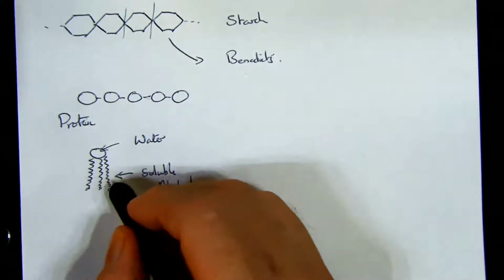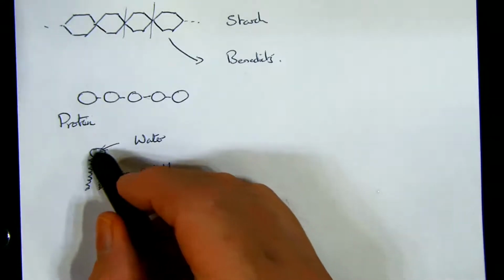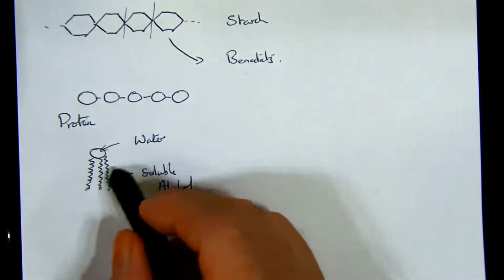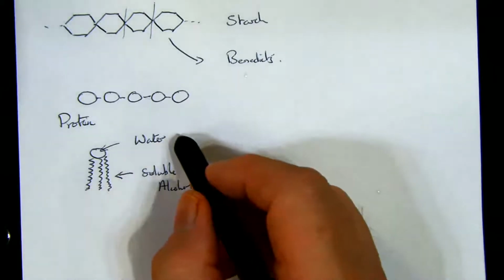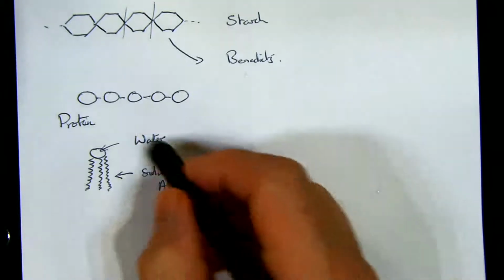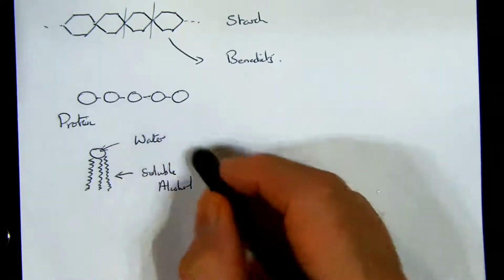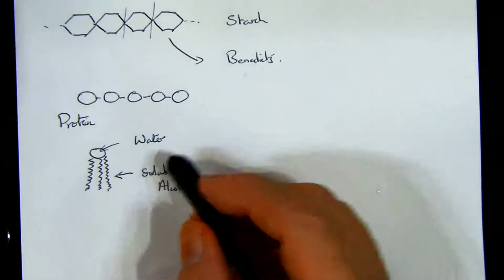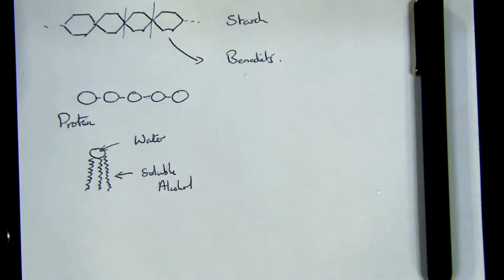This is fat. So this is, I suppose, similar to a washing up liquid molecule. We've got this water loving end and this fat loving end. Hydrophilic, hydrophobic, and we're going to use those properties with the alcohol and the water to try and make an emulsion, which is cloudy. So there's our basic ideas of what we're going to do.